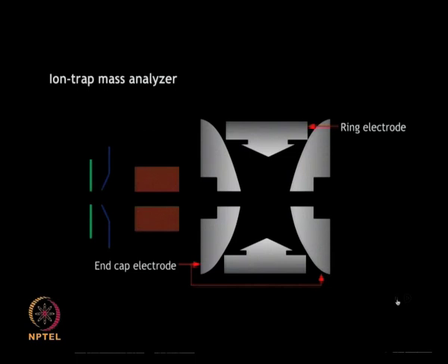An ion trap makes use of a combination of electric and magnetic fields and captures ions in a region of a vacuum system or tube. It traps ions using electric fields and measures the mass by selectively ejecting them to a detector.